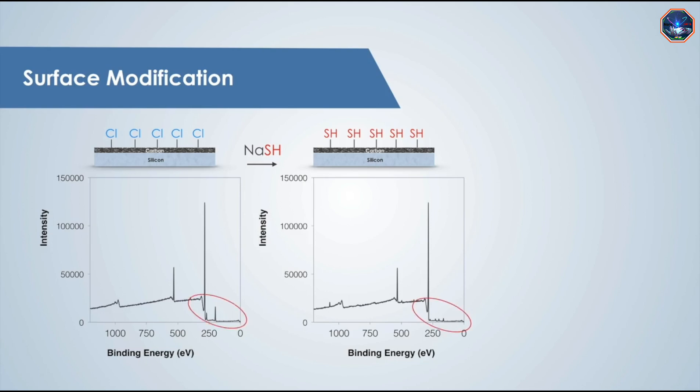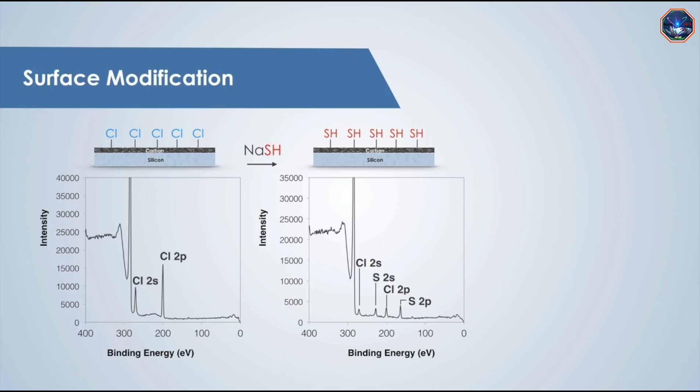And if we zoom into the lower binding energy region, we can see that the two new peaks are energies consistent with the addition of sulfur to the surface. But there are still small chlorine peaks present.